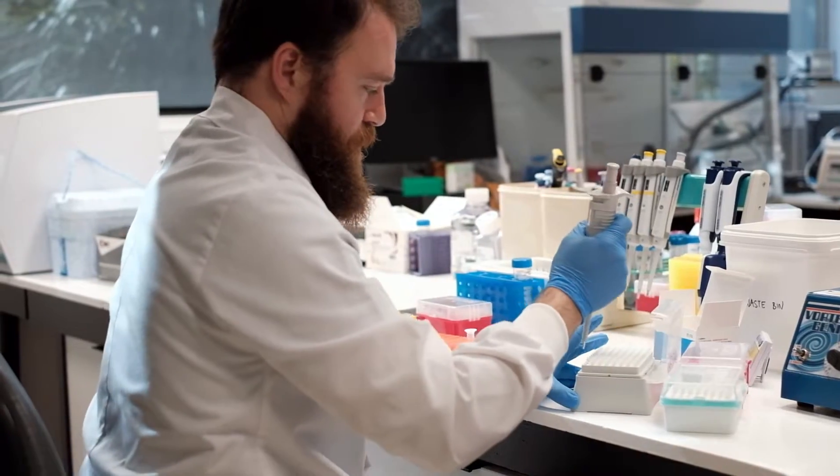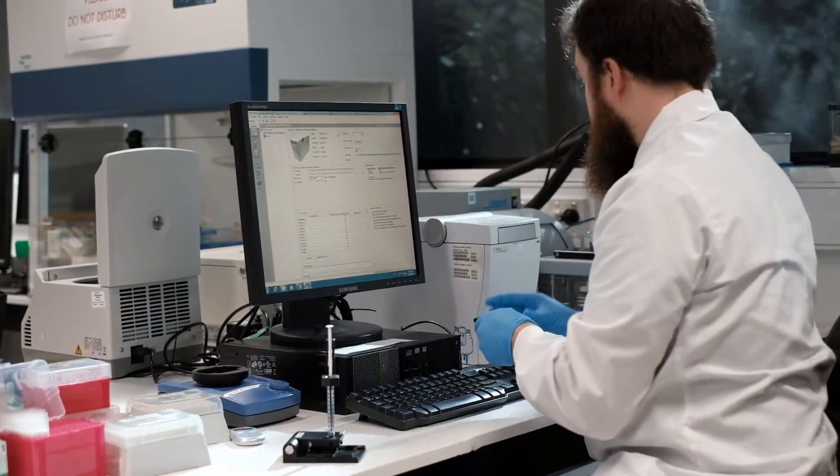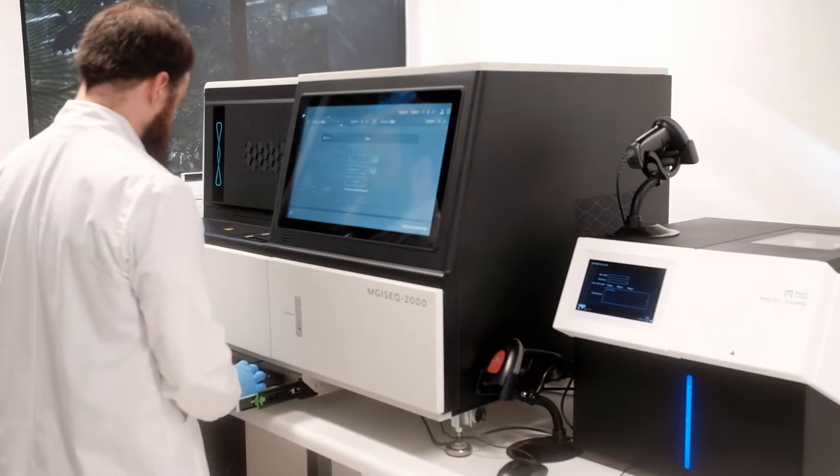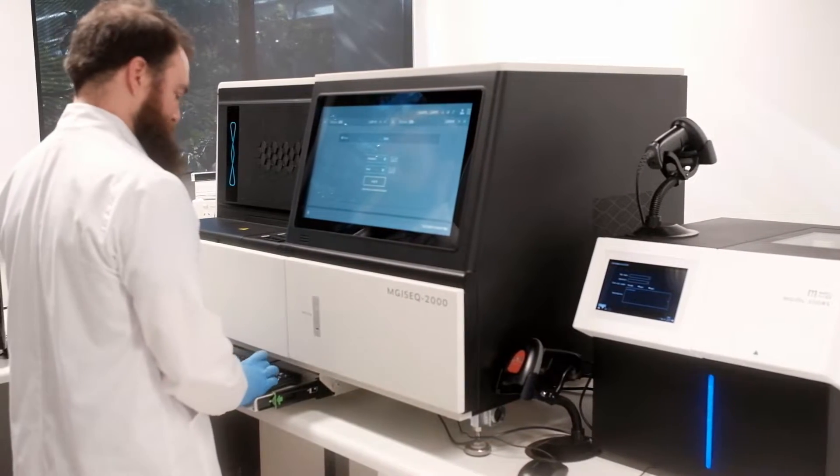Our two main focuses in that area are next gen sequencing with the newly acquired MGI instrument and Sanger sequencing.